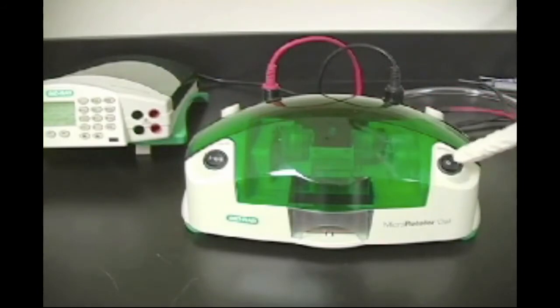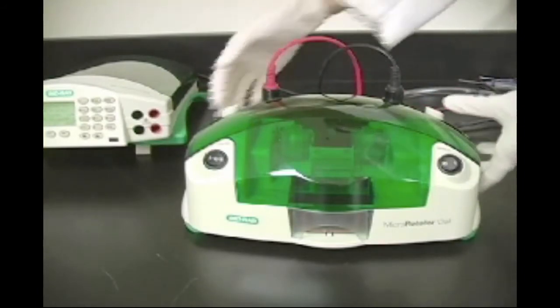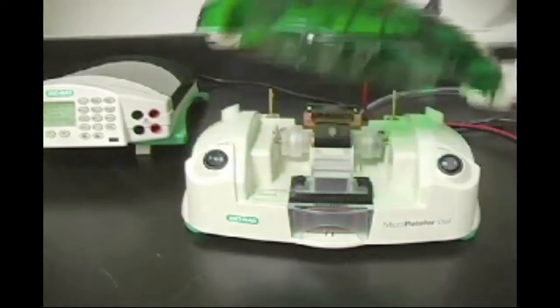When the run is complete, turn the power supply off and disconnect it from the microrotophore cell. Turn off the power to the oscillating motor and cooling block and remove the lid.